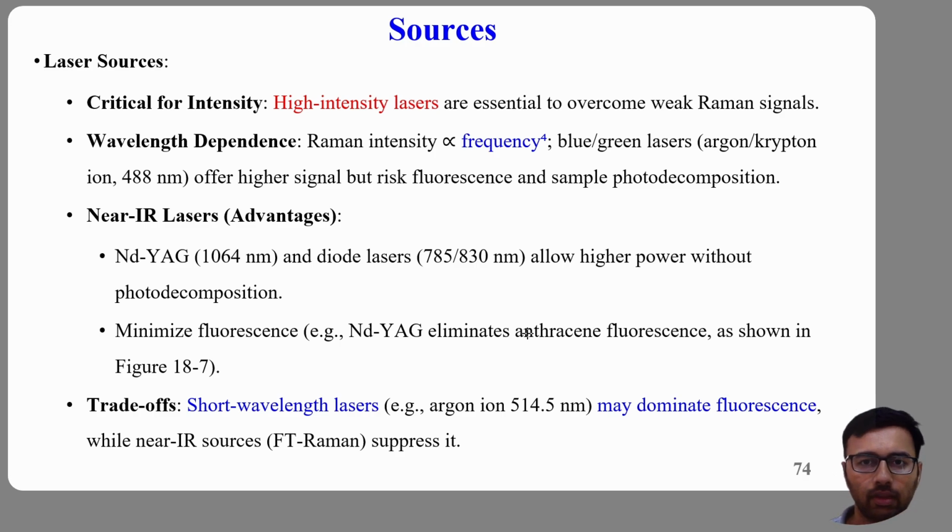However, there is a major complication. High energy photons can excite real electronic transitions within a sample. This triggers fluorescence. The fluorescence is enormously brighter than the Raman scattering, often thousands or millions of times brighter. If fluorescence occurs, it completely overwhelms the Raman spectrum. The detector becomes flooded with fluorescent light, and the Raman peaks disappear into the background. This is especially problematic for organic molecules, biological samples, dyes, pigments, and polymers.